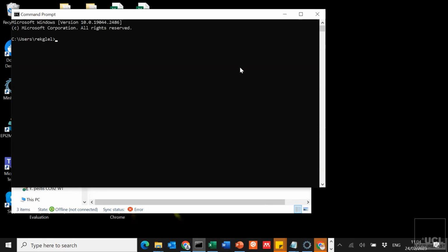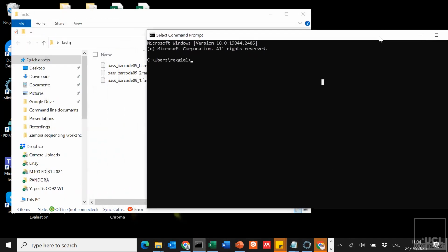So you need to bring up your command prompt. So this is Windows. John can perhaps check because it's cat, isn't it, on Mac for concatenating? Yeah. So it's the same concept, it's the same command, but they've got different names. So in Windows, you need to type, in fact, let's check that. Yeah. So what we need to do is type the command that we're asking the computer to do to combine all of those things.